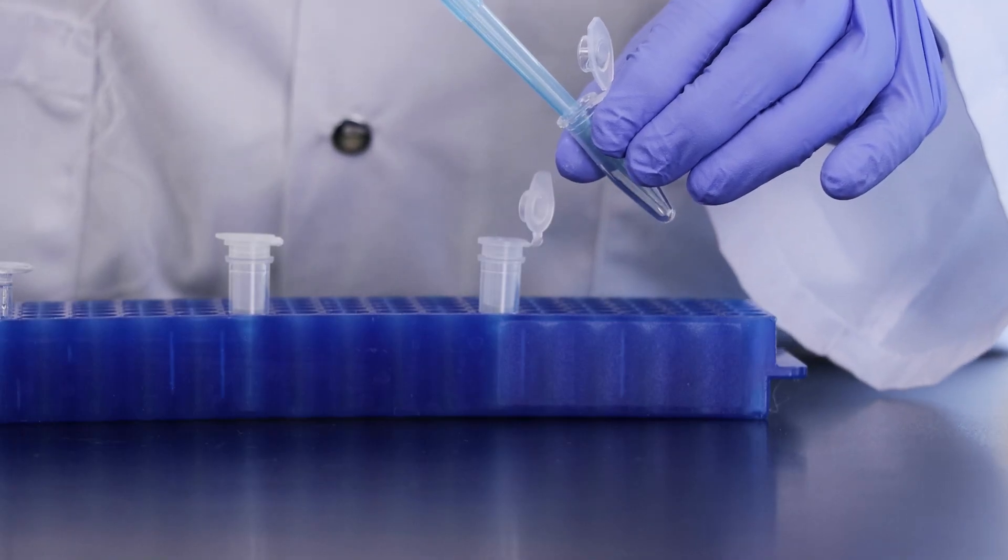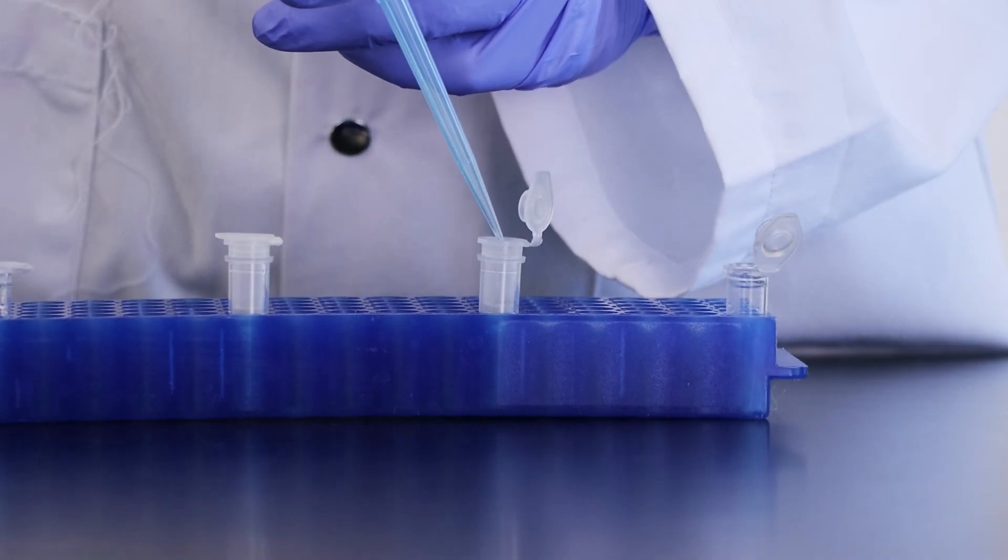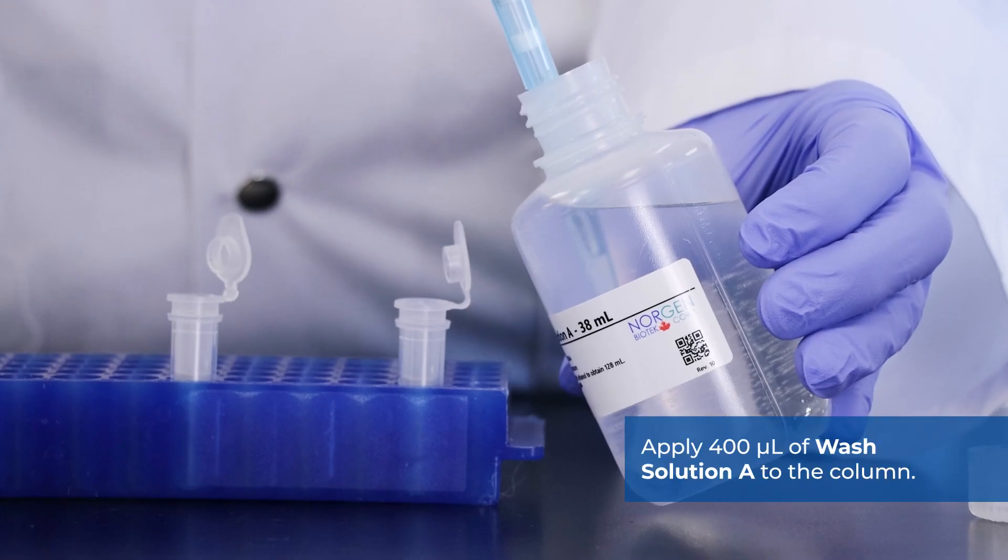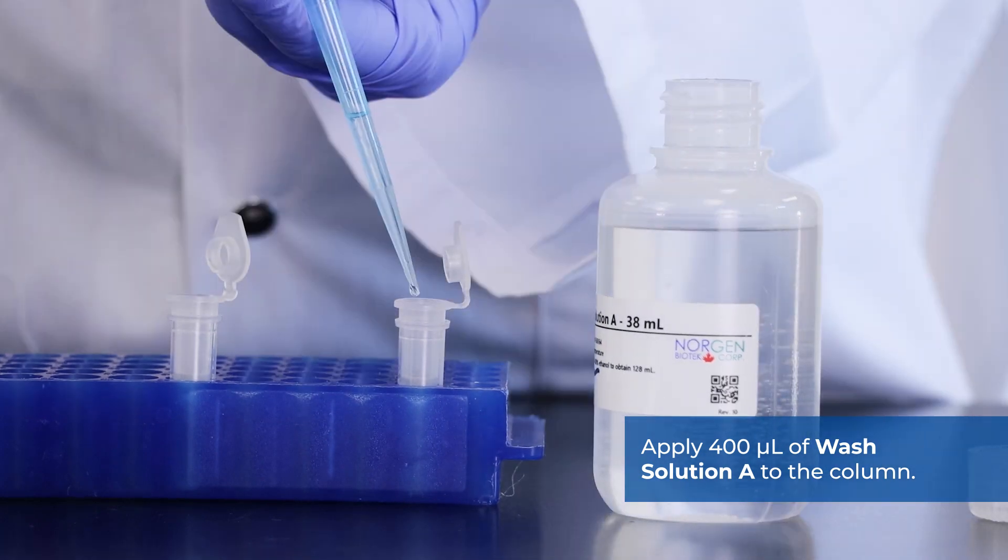Depending on your lysate volume, repeat until the desired volume is reached. Apply 400 microliters of wash solution A to the column.